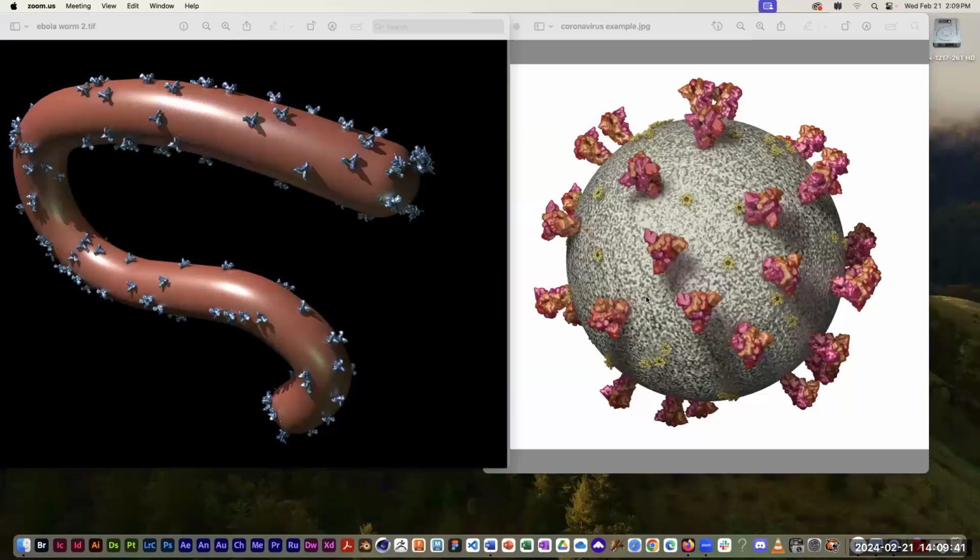All right, so a week ago, I introduced different kinds of technologies for seeing very small things. So various kinds of microscopy, like light microscopes, electron microscopy. We talked about different staining methods, things like fluorescence and so forth.